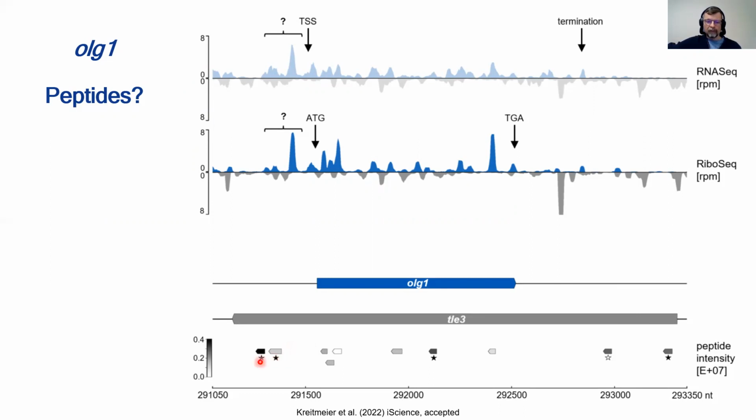So we picked a few, shown with the asterisks, and added some labeled peptides to the reaction, as Tina explained in the beginning. So for these 5 with the asterisks, we bought labeled peptides. We put the money out of our own pocket. And it worked for 4, which are black, and for 1 it didn't.